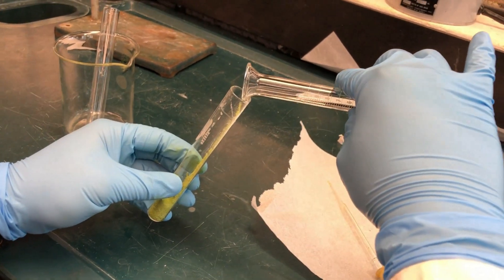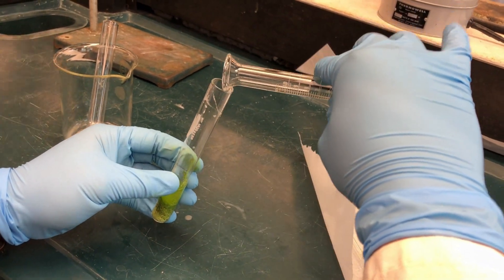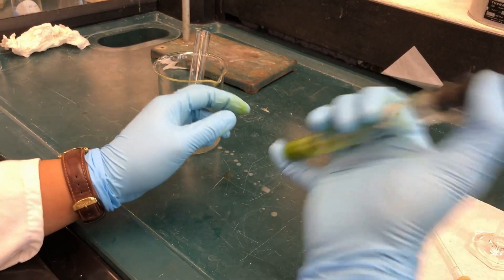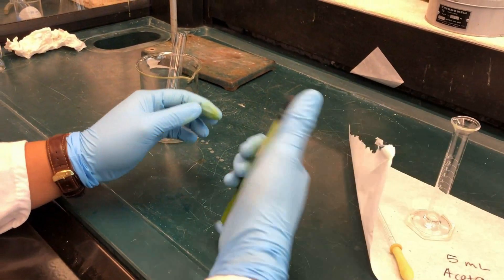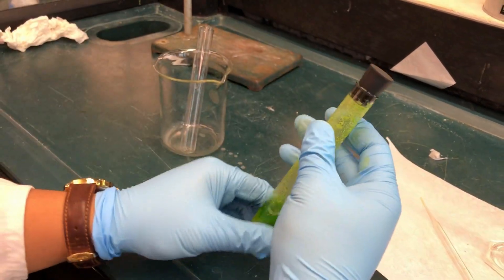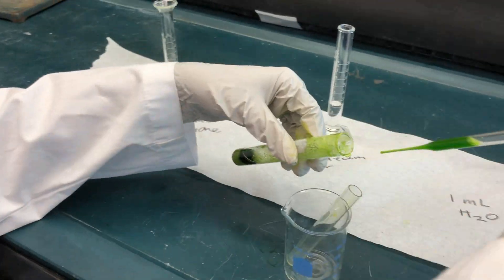Add 5 milliliters of acetone to the test tube and stopper with a silicone stopper. Shake for 5 minutes. Be sure to hold your thumb over the stopper so that it can't pop out. Remove the stopper occasionally to remove pressure inside the test tube.